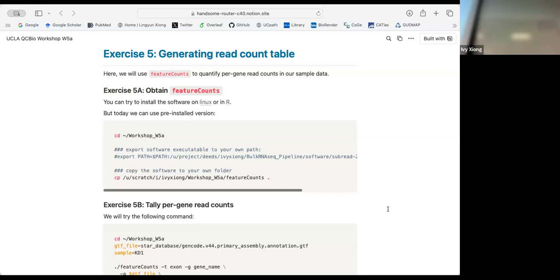And then save by control. And then now you can try running this. Did you have to create a STAR database? Got that. So now you have 2 batch jobs submitted. So you can check the status using this, and then we just change.